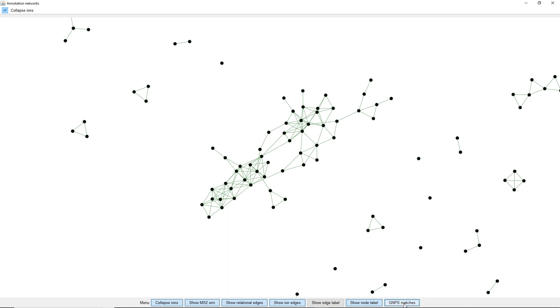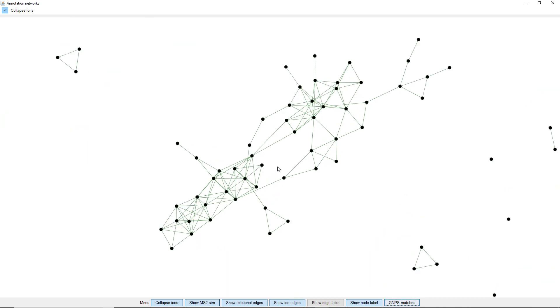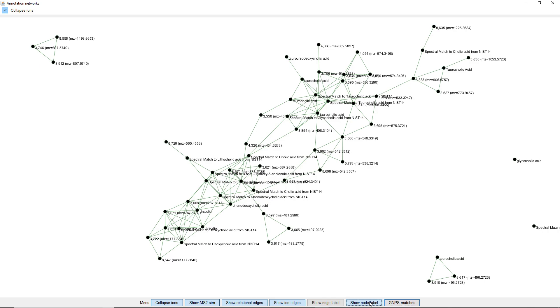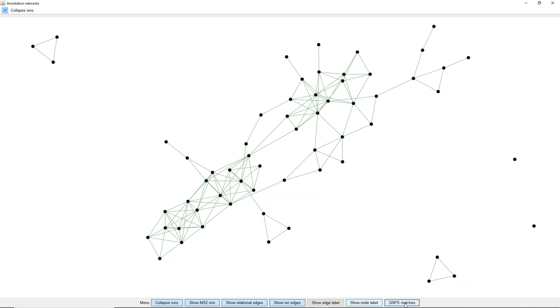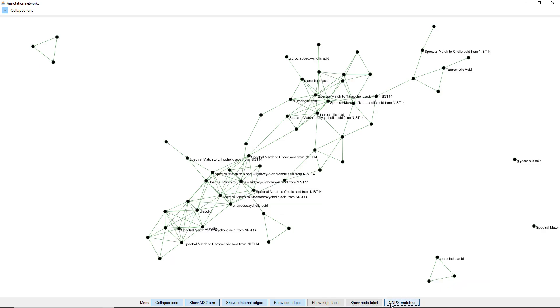We can also see the GNPS matches here. If we zoom in and get rid of the node labels, we can see we have Taurocholic Acid and so on. All of the cholic acid derivatives are just in one cluster here, and maybe some outside, but basically in this cluster.